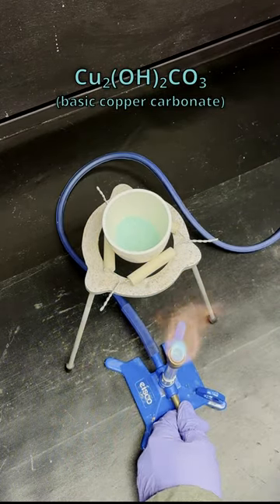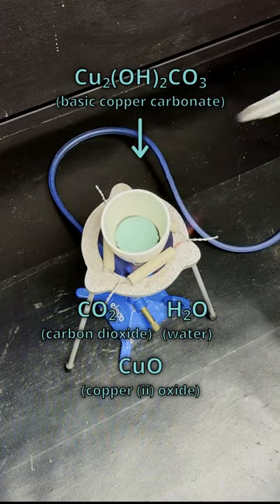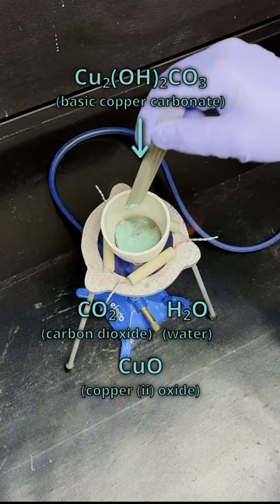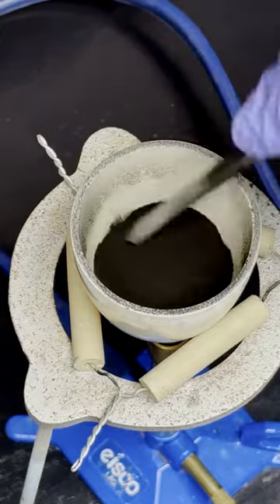With strong heating over a Bunsen burner, it decomposes, giving off water and carbon dioxide as gases and leaving copper oxide behind. It's pretty easy to see this reaction as it happens, as it sends up geysers of gas and turns the dark color of copper oxide.